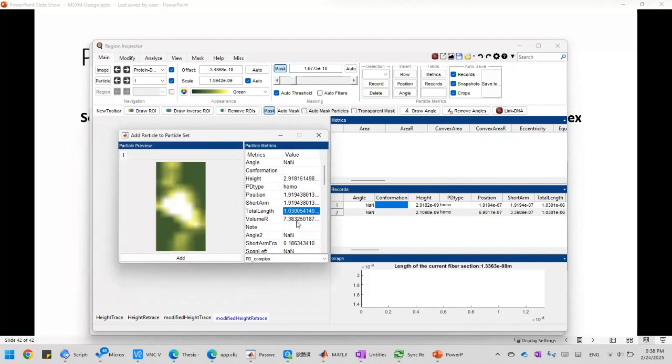And why is it important to include the position information? That's because typically in protein DNA analysis, for example in my study, I studied DNA repair. The DNA repair proteins would specifically bind to a DNA structure such as a damaged DNA site. So the position matters, right?